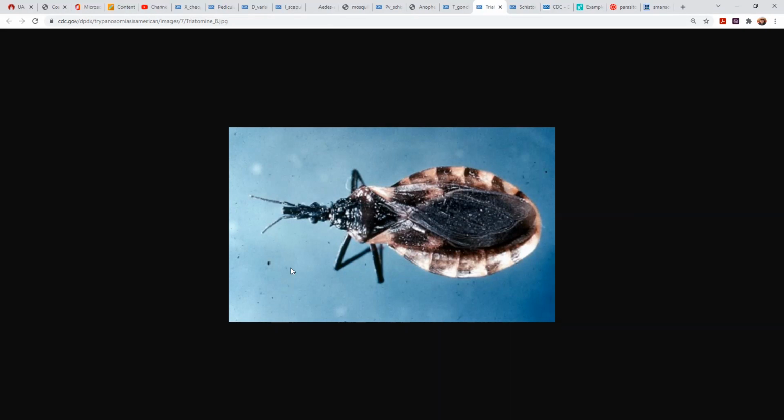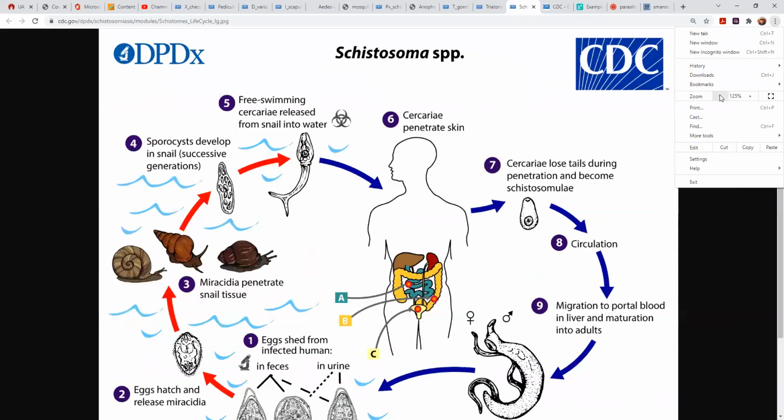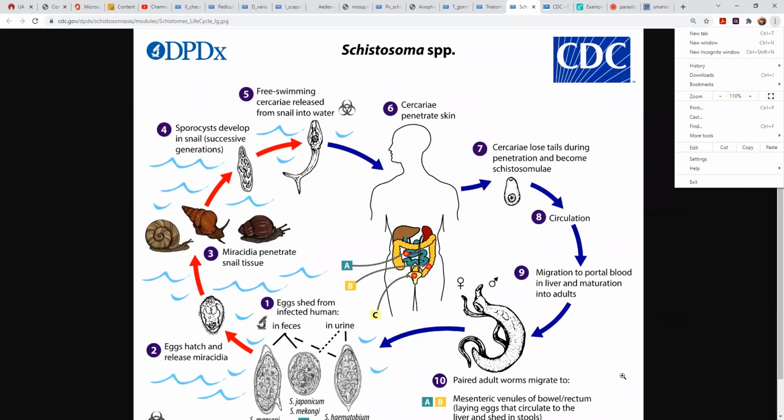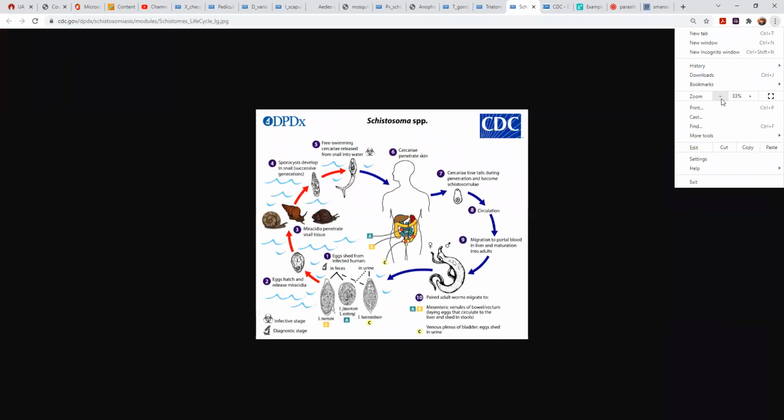Now, our last few things that we're going to look at here are for a particular organism called Schistosoma mansoni, which is another type of fluke. We looked at Fasciola hepatica in Lab 22, and Schistosoma mansoni is also a fluke. Let me come down here. It looks a little bit different than the other type of fluke, and it has a very complicated life cycle.